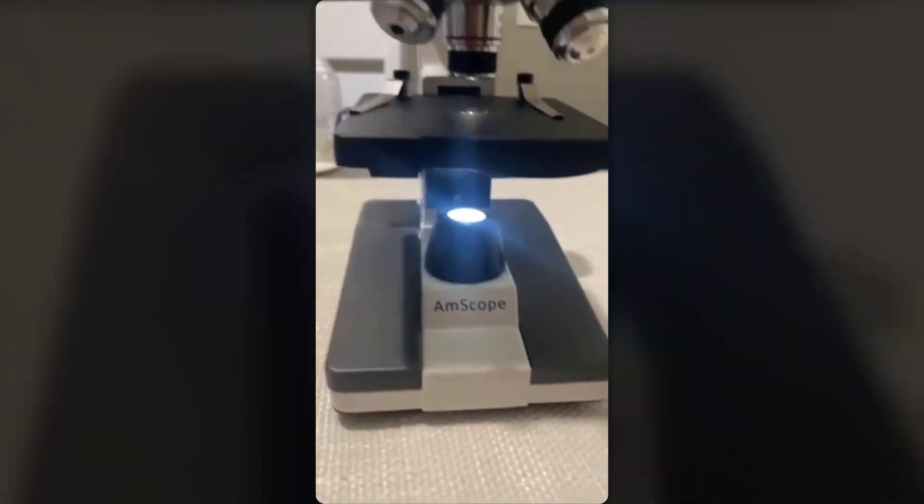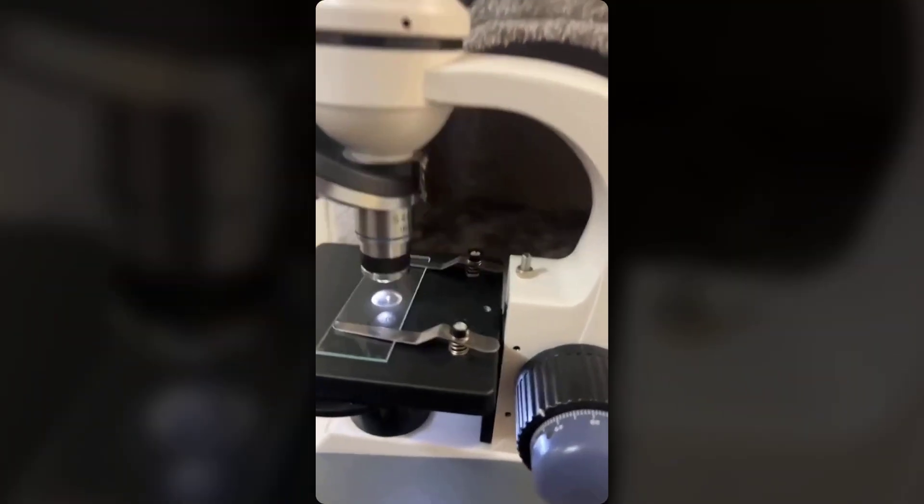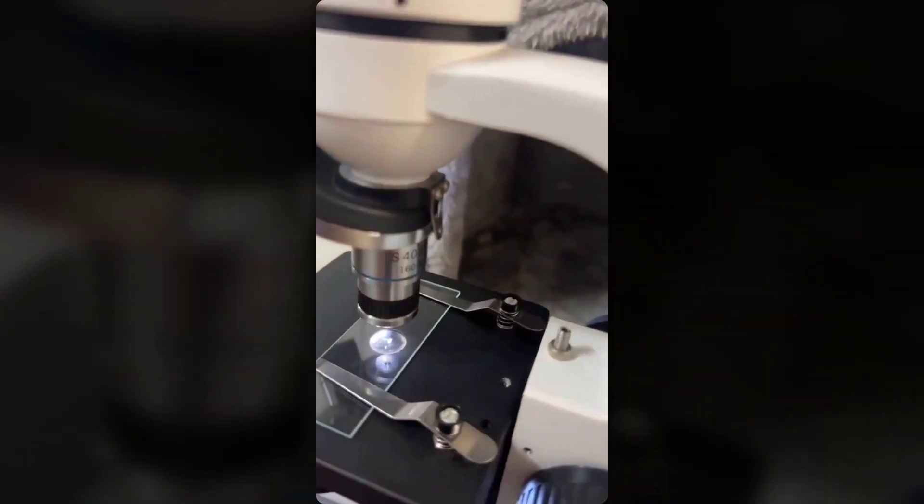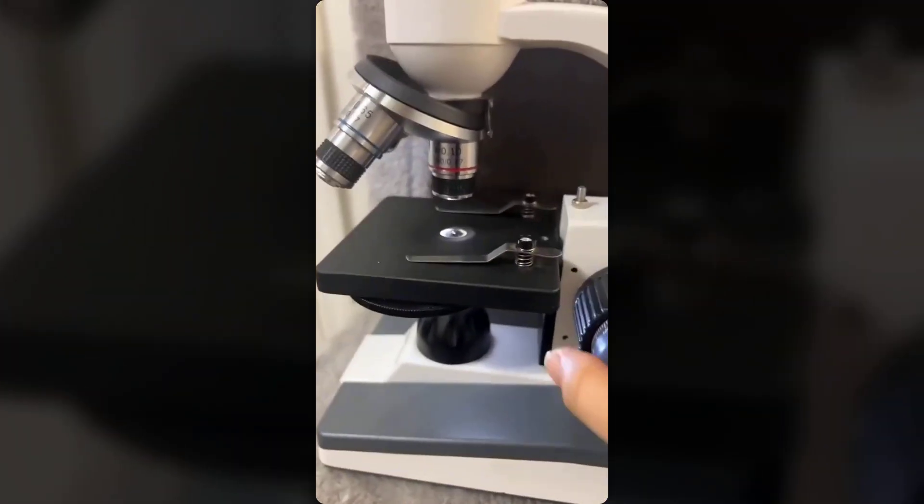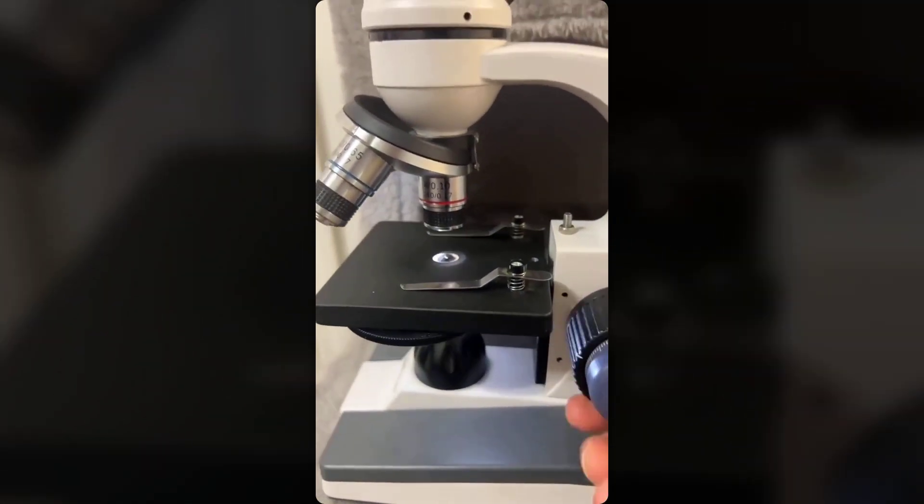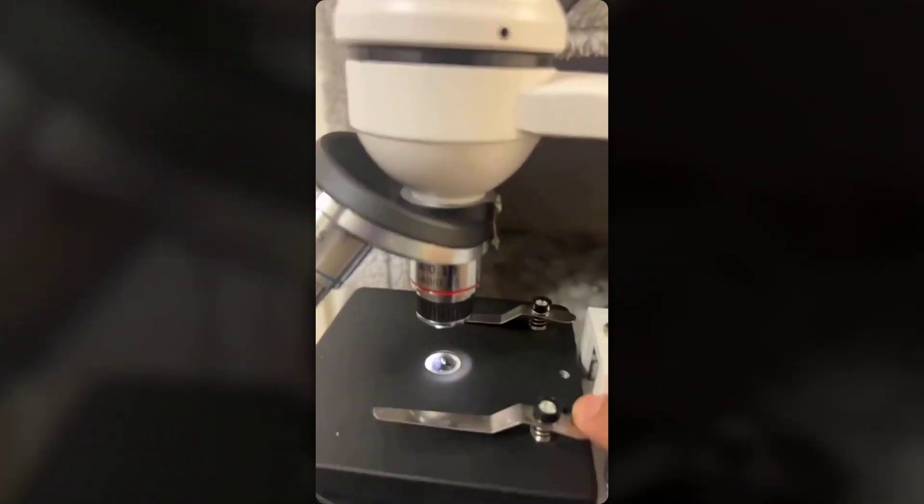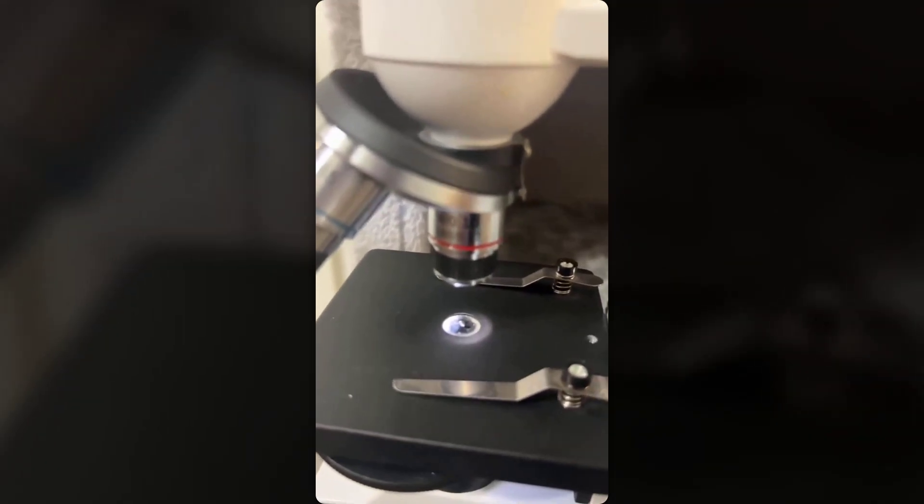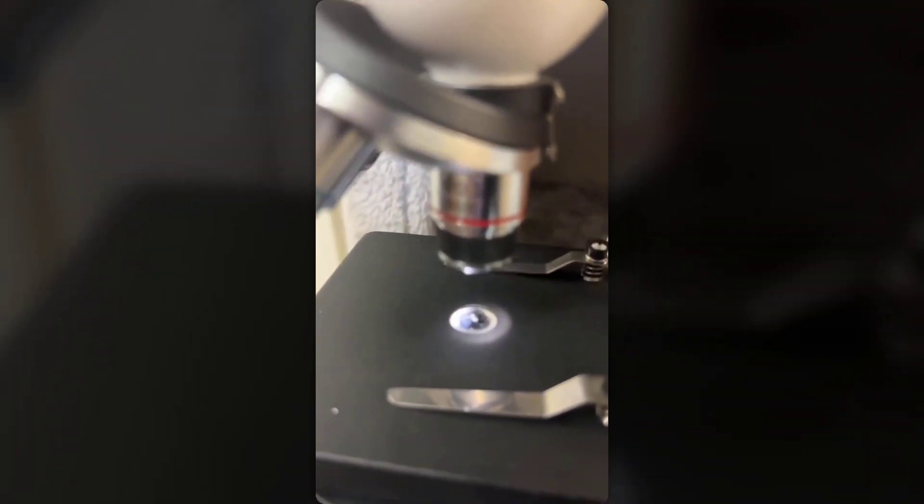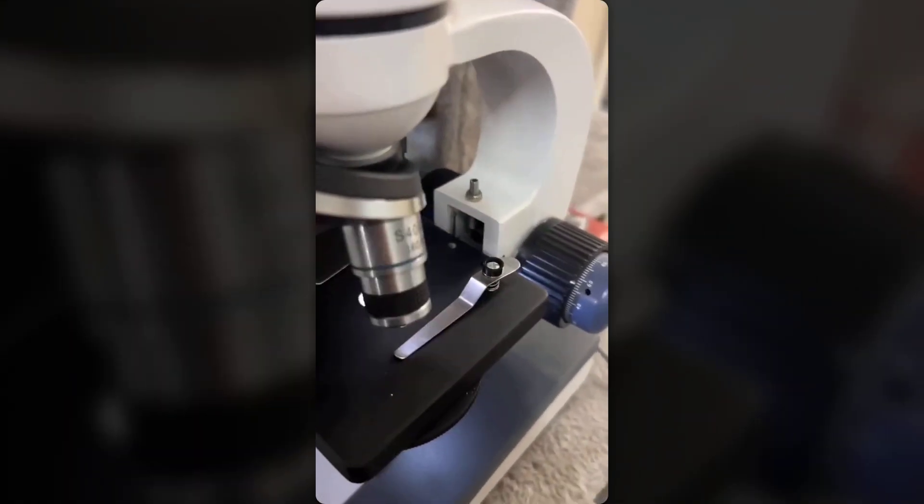The high-quality glass optics produce exceptional image clarity, reducing common focusing issues often encountered with comparably priced digital alternatives. The integrated LED illumination system performs effectively across most viewing scenarios, though it may benefit from additional brightness at 1000x magnification. While the single eyepiece design requires slight adaptation, particularly for users familiar with dual eyepiece models, it maintains excellent viewing quality.